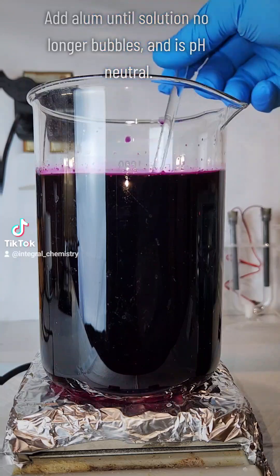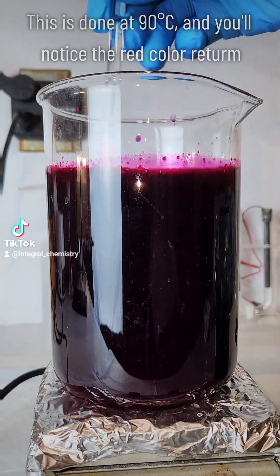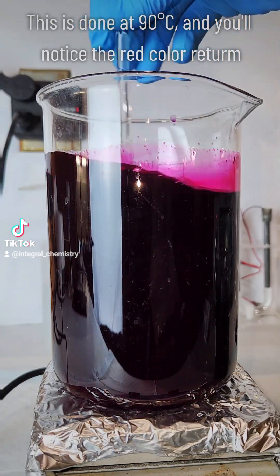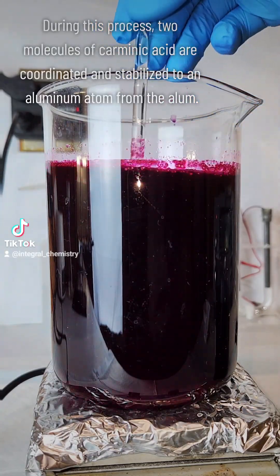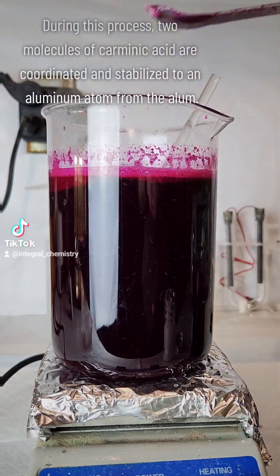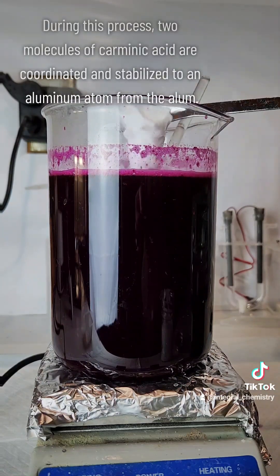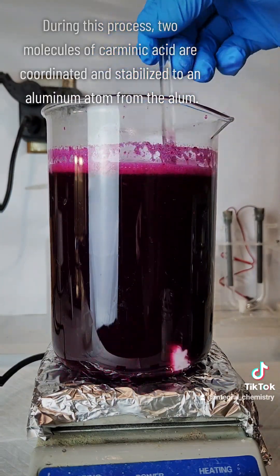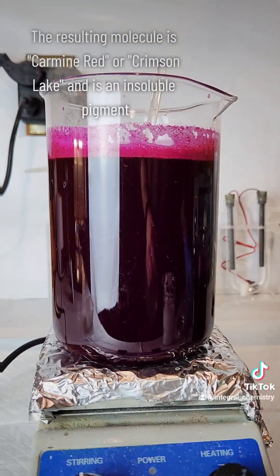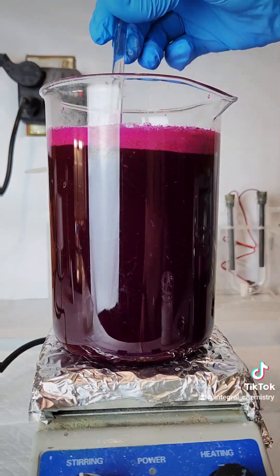Once I get a relatively pure carminic acid solution, I'm going to heat my solution to 90 degrees Celsius and slowly add potassium or sodium alum until I reach a neutral pH. You can use litmus paper for this, but the problem is the solution is so dark it'll be hard to see the color of the litmus paper. It's better to go by color — the solution will return to a bright red as it neutralizes — and also by the bubbling; if you use sodium carbonate, the solution will begin to aggressively bubble as you reach neutral pH and stop once you've hit that point.